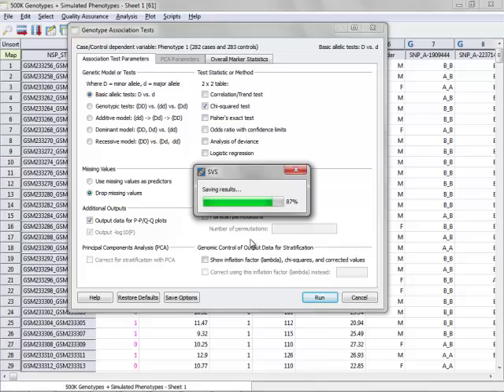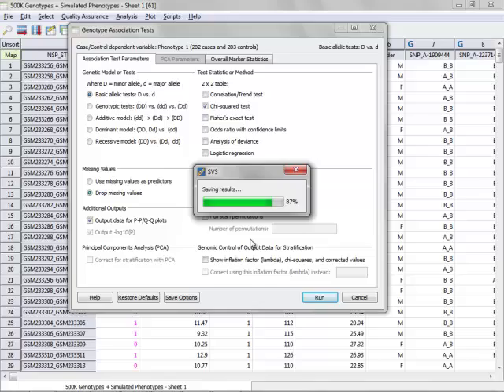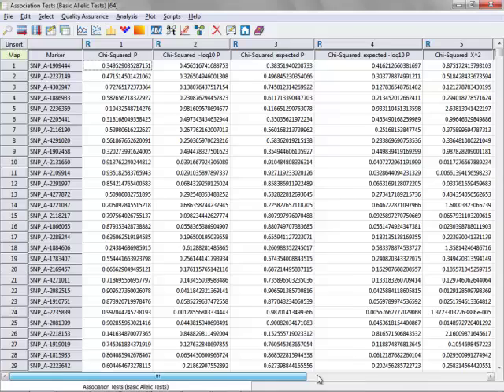We'll now compile the results and then output a spreadsheet that's got the various test statistics that we just chose. Here we've got chi-square p, the negative log 10p of that column, the expected p, as well as the Bonferroni correction here at the end, and the false discovery rate.